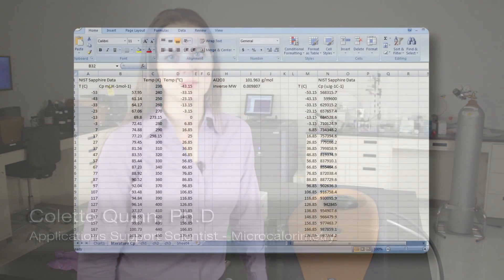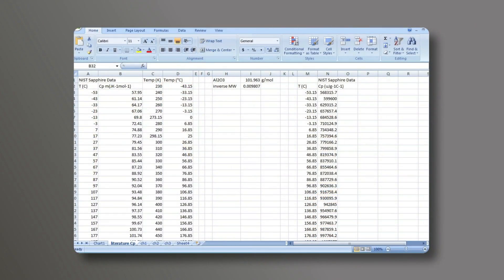In this TIA Tech Tip, we'll be discussing calibration of the multi-cell differential scanning calorimeter. During the calibration, the data has already been collected and now it's going to be processed in Excel.